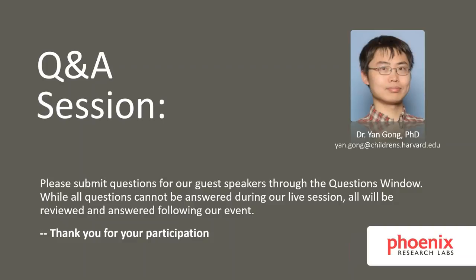Great. Thank you again, Dr. Gong. And a question has come in, which is a bit more centered on the technology. The question was, what is the laser spot size on the Micron 3? And is that different than the size on the Micron 4? Perhaps, Scott, you'd be willing to take this one?